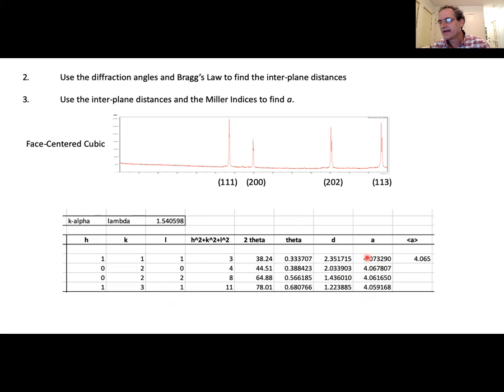It's like a flat. And then finally, we can take the average of all of them, and that's our lattice constant. All right? So it's straightforward enough, but this is the technique you're going to use on all the materials that you measure in the X-ray lab, okay? And in the end, you'll have the lattice constants, and that's what you need to make the final graph.